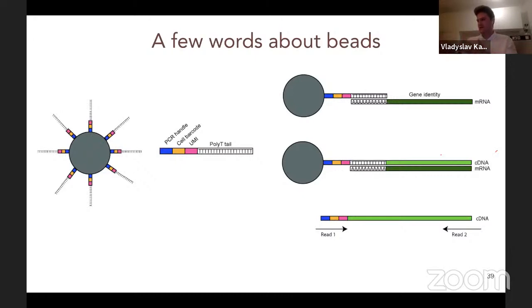And the third step of the quality control would be the bioinformatical quality control. That means when you are analyzing your data with bioinformatical methods, you have a possibility to discard the cells that are dead, that have very low amounts of genes expressed and so on. So you have these three major points of quality control steps in your single-cell analysis.